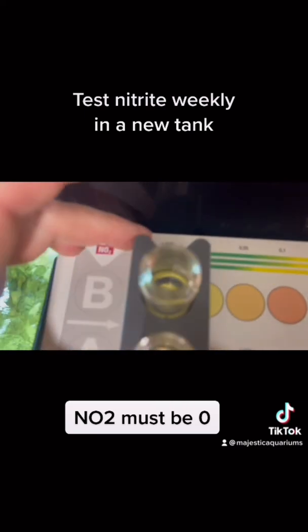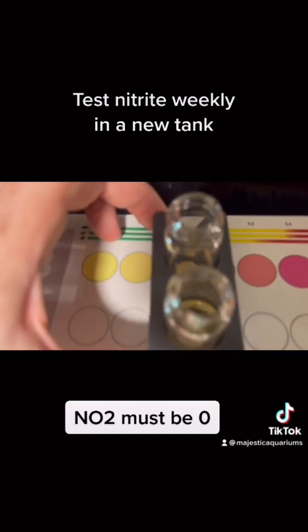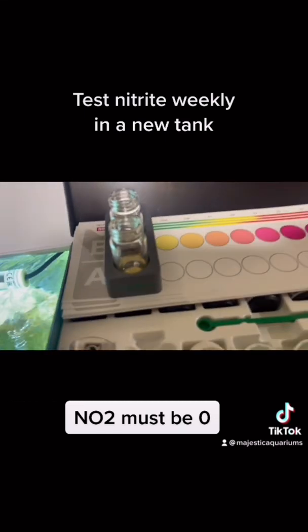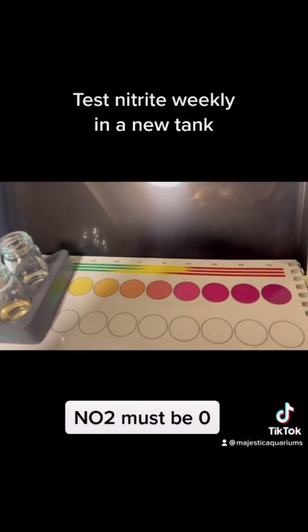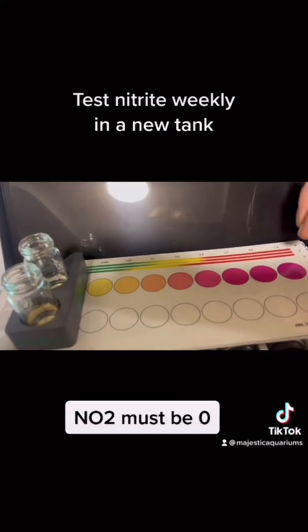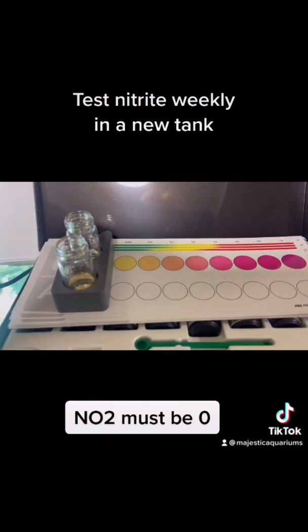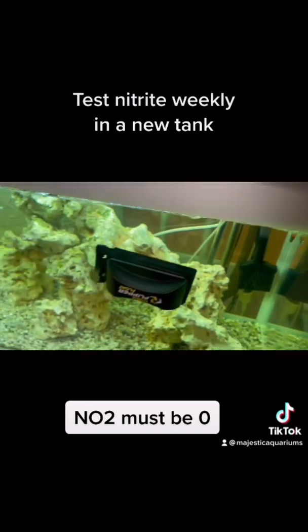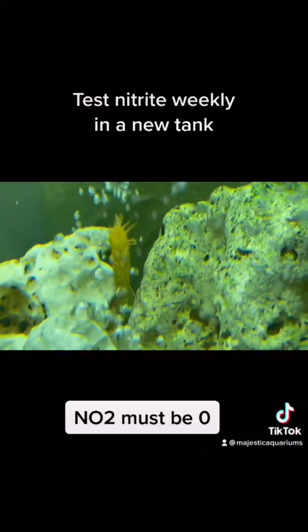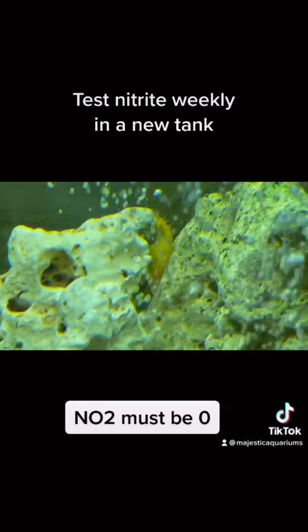Then we're going to look down this and see what color it matches up to. In this case, the colors of my eyes look totally different to the colors from the camera. So it's lighter than that. I'm going to say it's 0. Now it looks a little bit oranger in the camera, but let's get over that. So there is no nitrite because the color is very, very light. If the color got darker, then that's bad. So right now the nitrite is 0, which means the bacteria that breaks the ammonia into nitrite is going well in the tank, and the bacteria that breaks the nitrite into nitrate is going well in the tank.